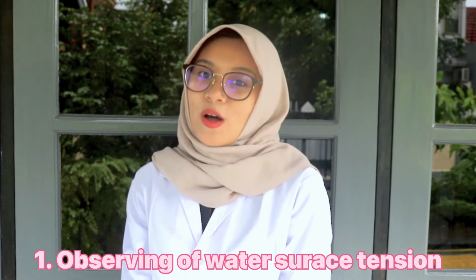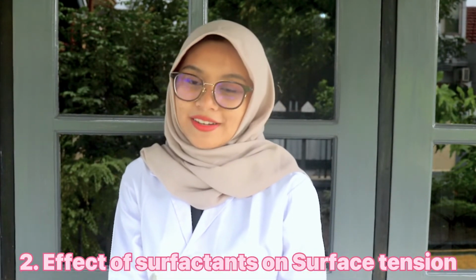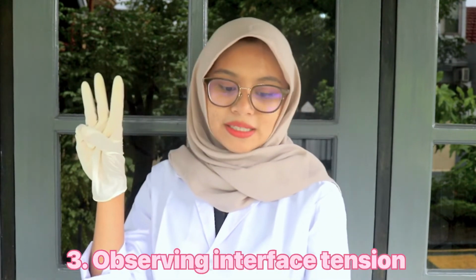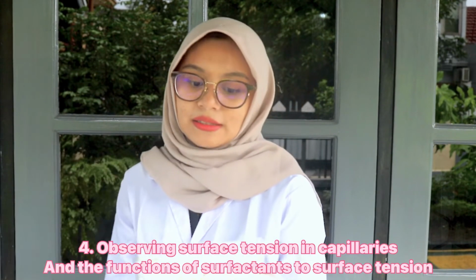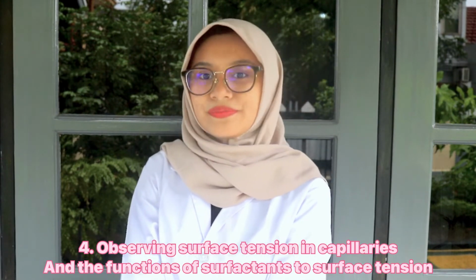Alright, in this video I'm going to do some practical experiments, titled surface tension and interface tension. There are 4 experiments that I'm going to do in this practicum. The first is observing water surface tension. The second is the effect of surfactant on surface tension. The third is observing interface tension. And the last but not least, observing surface tension in capillaries and the function of surfactant to surface tension. Hope you enjoy my video of practical experiments and happy watching!